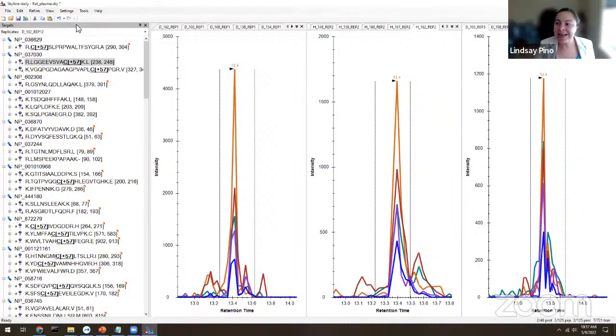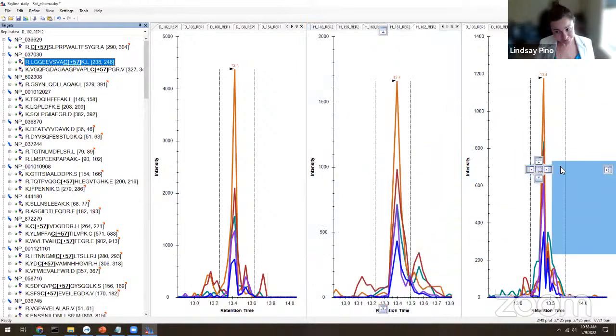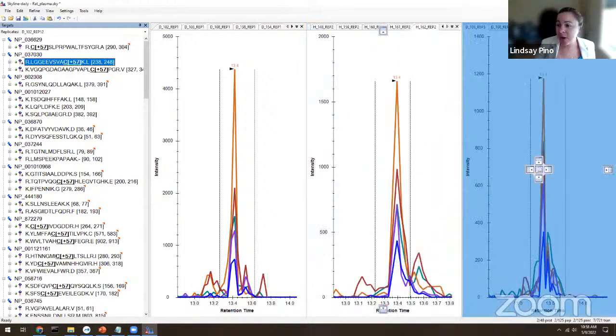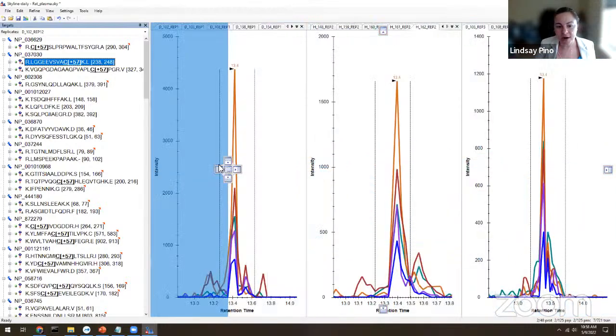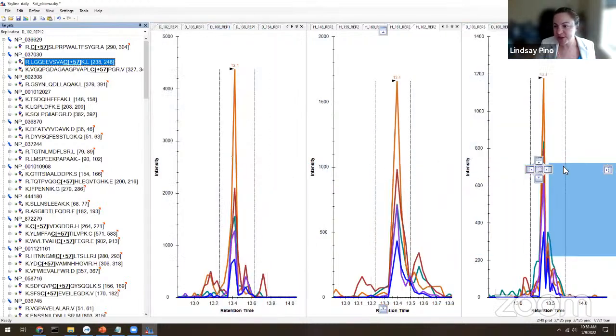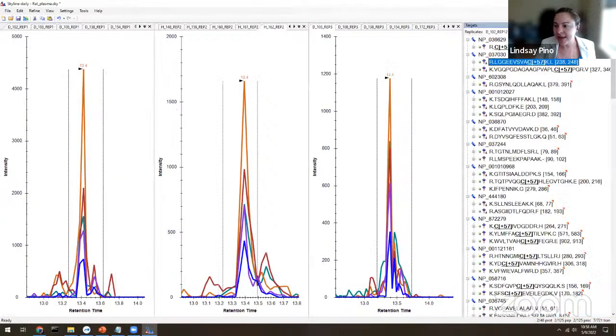First, you can click and drag and dock any of these windows wherever you want. So for example, now I'm going to click on targets. I click and hold on targets, and you see now I have this blue window. I'm click and holding, and I can drag that wherever I want. As I'm dragging it, some of these windows are popping up and give me the option to dock at this location. So over here on the far right, if I finally release that click and drag, now my target window is docked on the right-hand side.